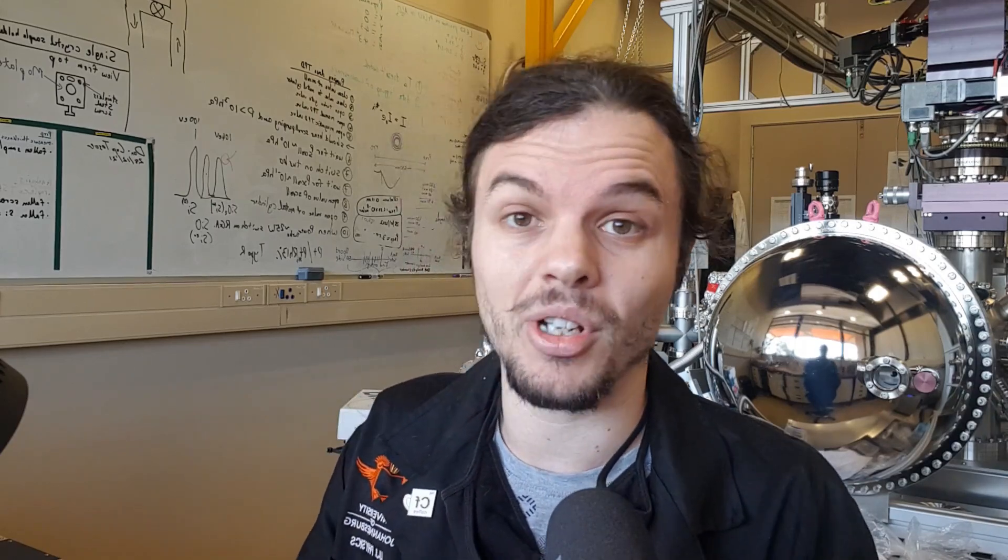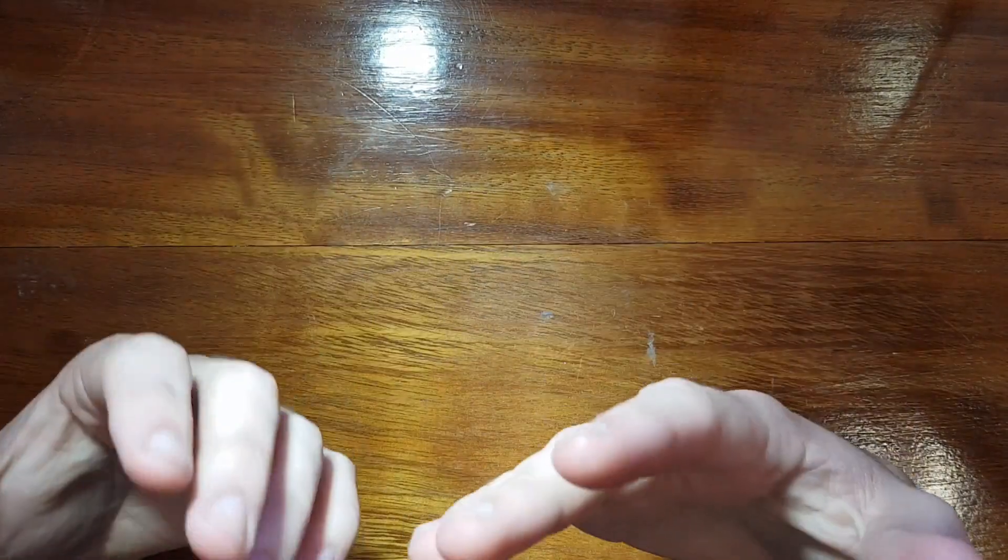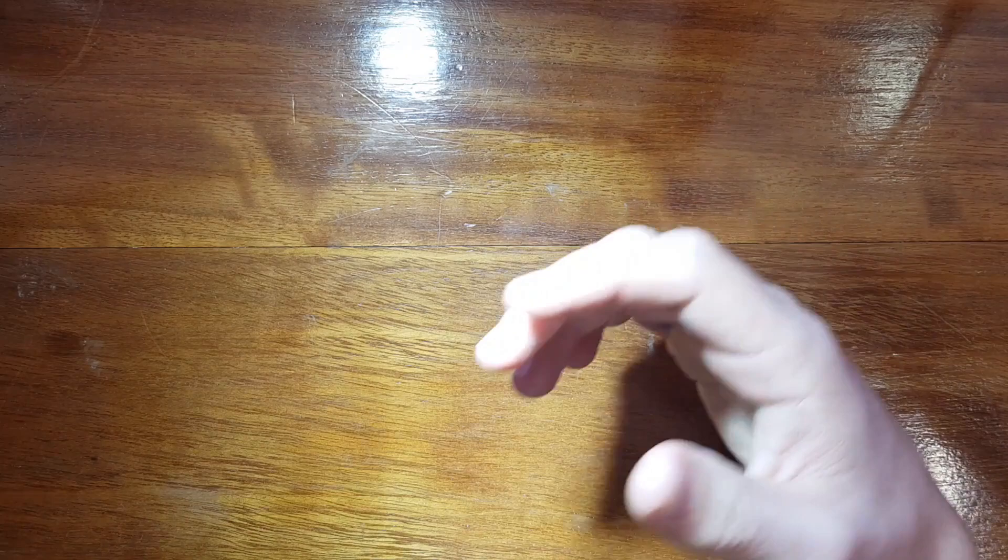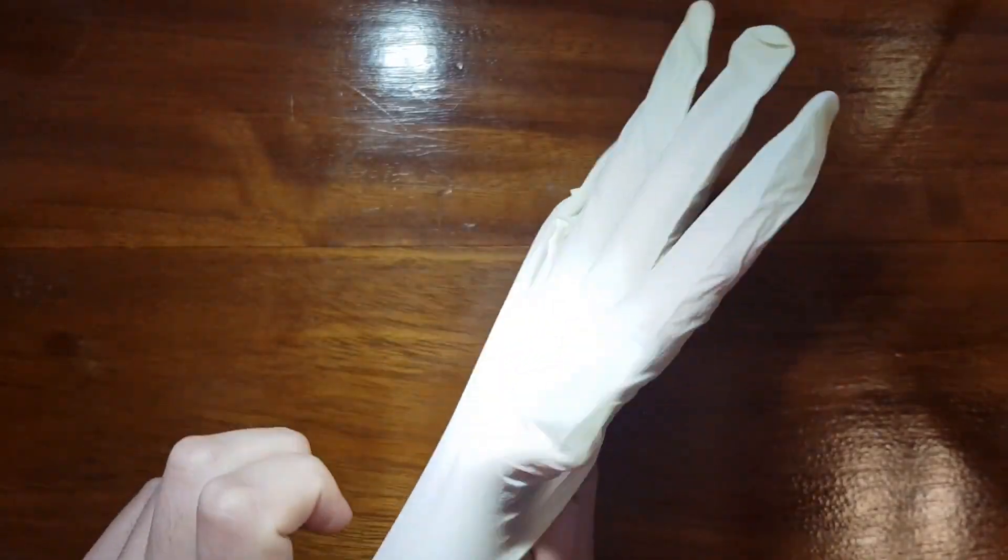Excuse the noise, it's a loud environment and I'll do my best to speak clearly and improve the audio in post. Let me get this camera facing the bench and let's get started. Welcome to the workbench. Now the first thing we're going to do is glove up, and the reason is you don't want the oils from your fingers to get onto the sample holders.